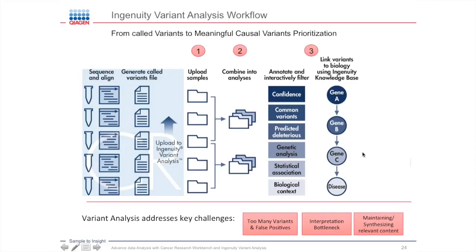And what that does is allow you to go above and beyond what is known. So maybe today, we know in the literature, because of the curation, that a variant in gene C will cause a given disease. But maybe the variants that you have in your file or in your sample are in gene B or gene A. Because of all the other information that we have in the knowledge base, we can run analytics and say, well, your variant that is in gene A causing a loss of function may actually impact gene B, because there's a loss of function of this gene. Therefore, all that signaling cascade may or may not be relevant to a disease or particular molecular function that you are interested in. So it's allowing you to link the variant and the biology in the knowledge base, to go above and beyond what has been published in the literature.